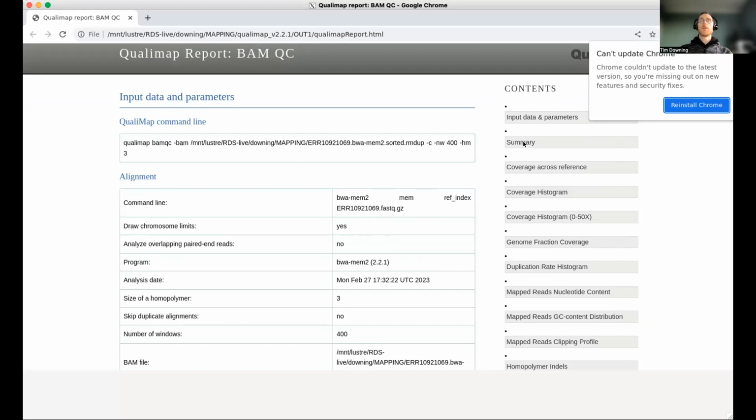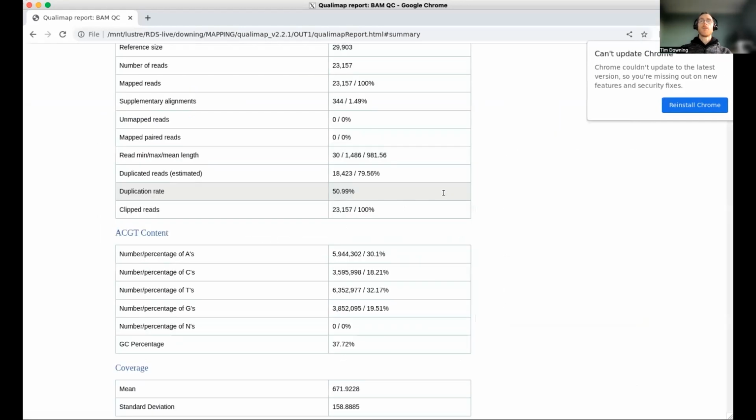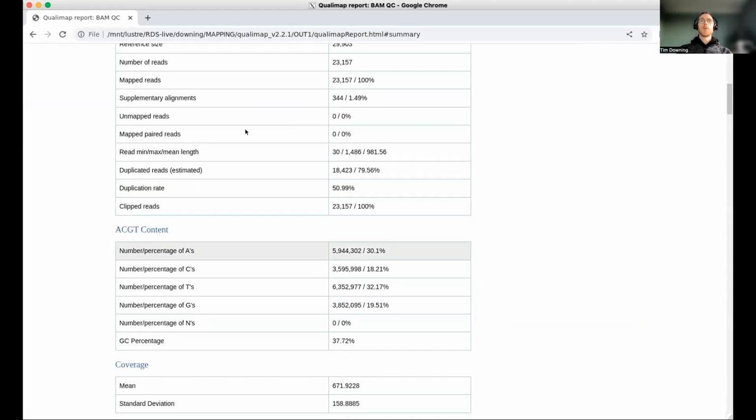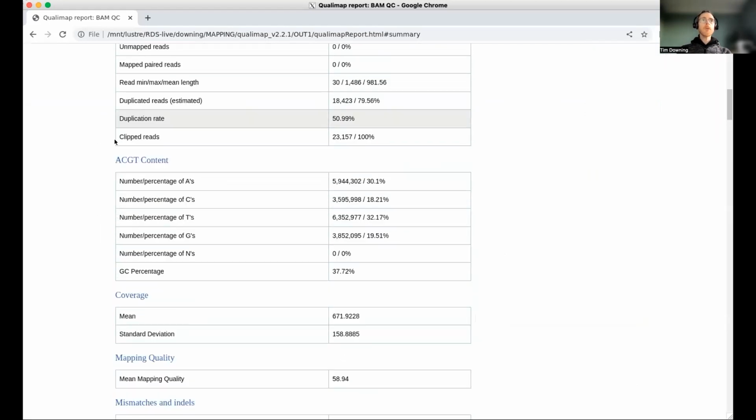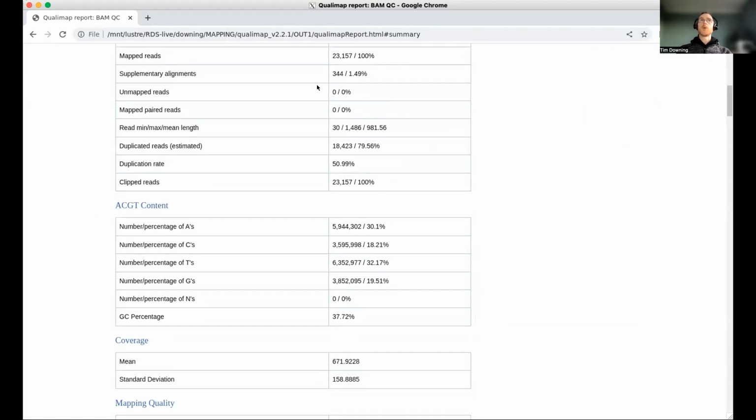So this is kind of the input basics in terms of the details. And if you scroll further down, then we find the information we had before, just in a different format. And this is for the final sample we were looking at there, but we could do it for all the reports, and it's the identical information we talked about already.